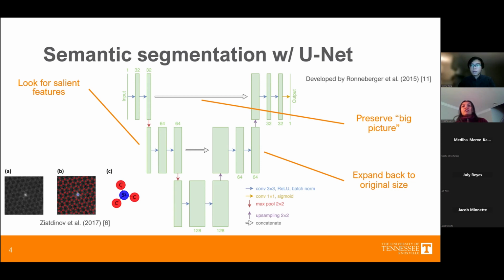And now when you add skip connections, you are directly adding, are you doing concatenation, or are you just adding the output of skip connections with the input of the image? What are you doing? I think it's a concatenation. Right. I want to say it's a concatenation, but that's one way it could be done. Okay.